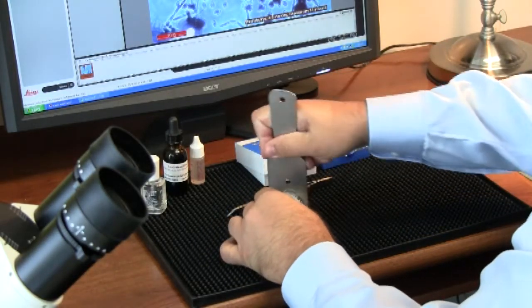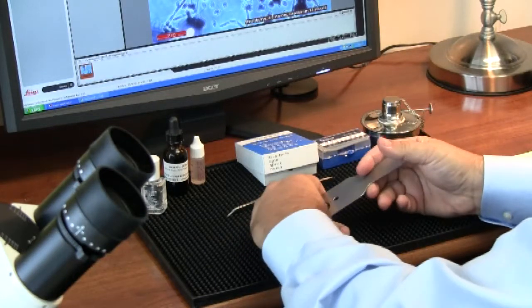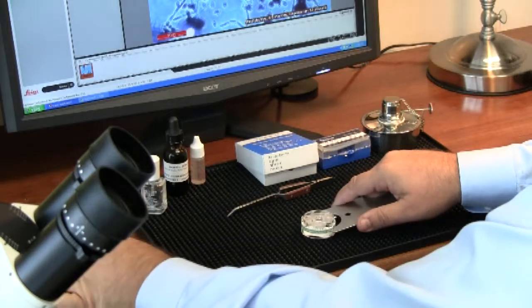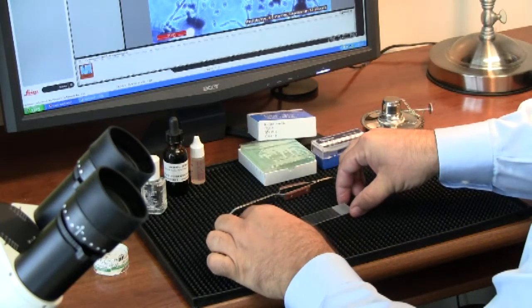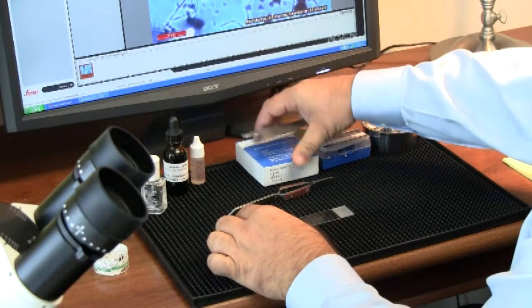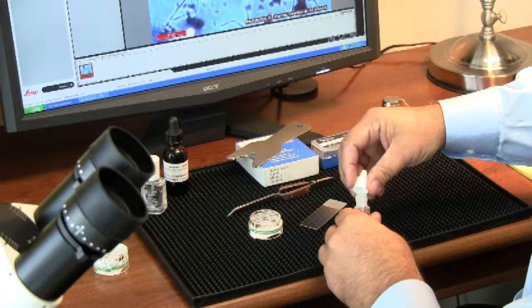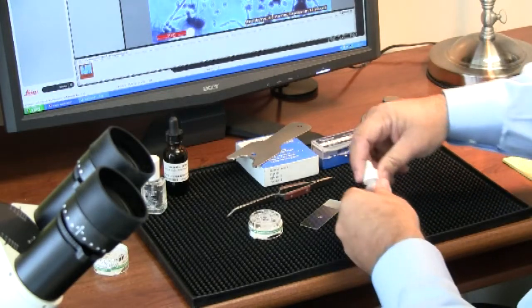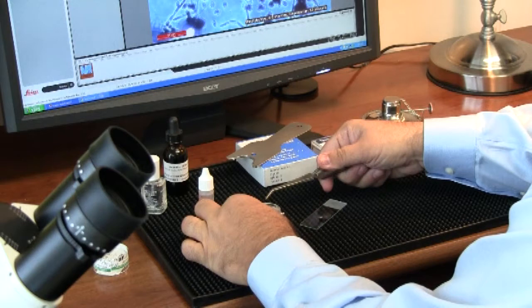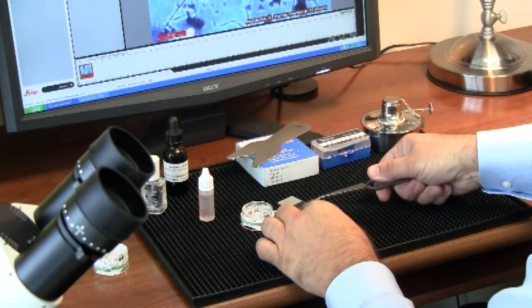Now we're going to take this slide from within the spore trap and mount it on a microscope slide. I'm going to dispense a drop of oil to eliminate the possibility of air bubbles getting underneath the slide. I'm going to remove the slide from within the spore trap — it lifts out at a 45 degree angle.